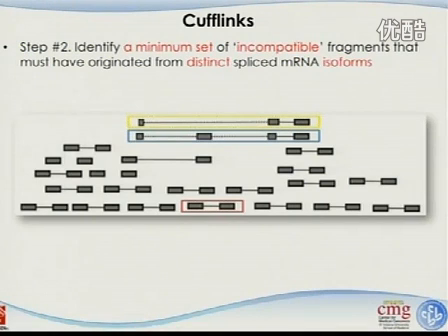There is no way they are from the same mRNA isoform. Okay? Let's think of why. For these two, you can see that for this one, the middle exon is included for sure. And for this one, the middle exon has been excluded. So these two reads are not going to be from the same isoform. That makes sense? All right?